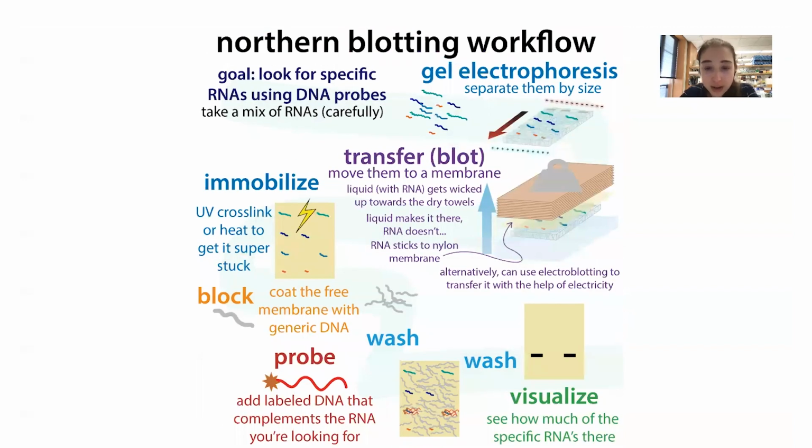To transfer DNA or RNA, what you often do is use capillary action, so wicking.